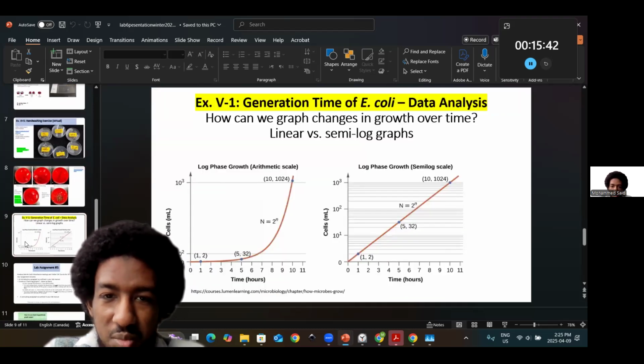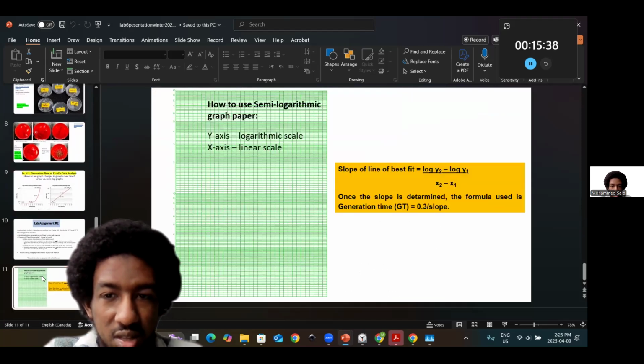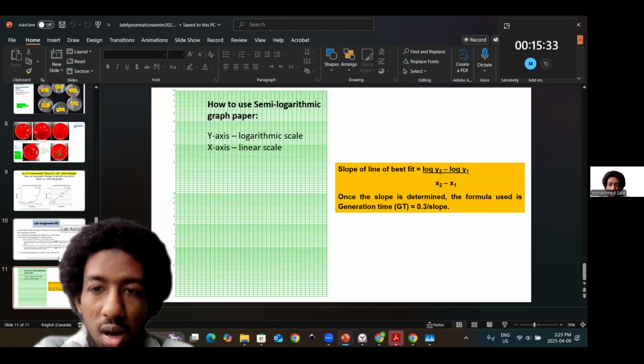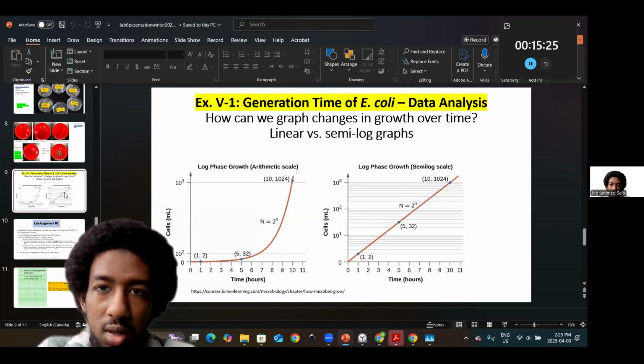And then the generation time assignment, we talked about this. Alhamdulillah, so this is pretty much completing lab 6. I briefly just want to highlight, for those that were wondering, that with the exercise about generation time, you're aiming to study the time it takes for your population of bacteria to double.